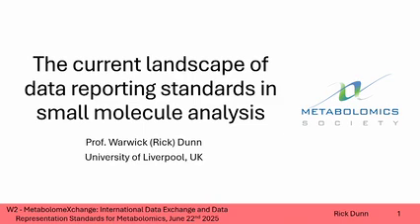I've called it small molecule analysis because, even though we're in the metabolomics community here, we're actually talking about lipidomics and exposomics. The types of techniques we're using and the problems that we have are very similar across all of these. So it's all focused on small molecules.